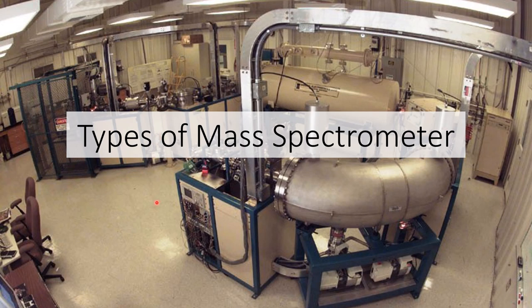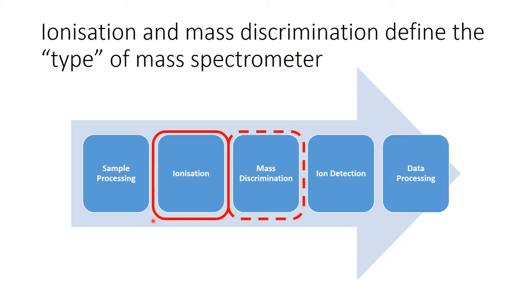Okay, so this is a video to follow on from the introduction to the generic mass spectrometer. So we're just going to look through different types of mass spectrometer in this video. The main things that characterize one mass spectrometer from another are the way that the samples are ionized and, to a certain extent, the way that they discriminate the heavy versus the light ions. To a large extent, the ion detections are quite similar between mass spectrometers.